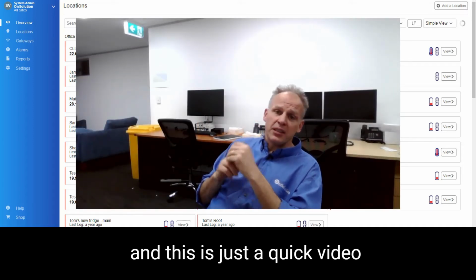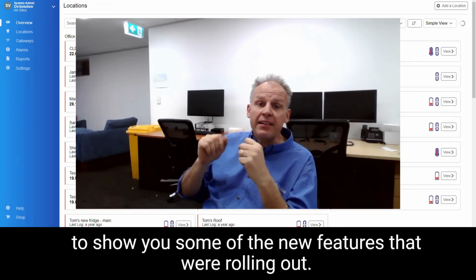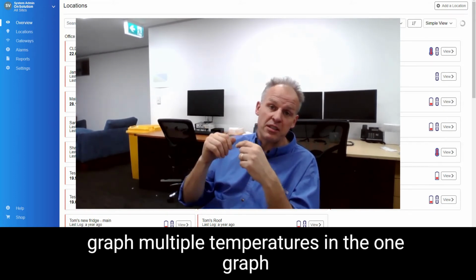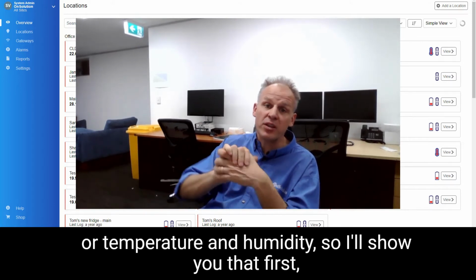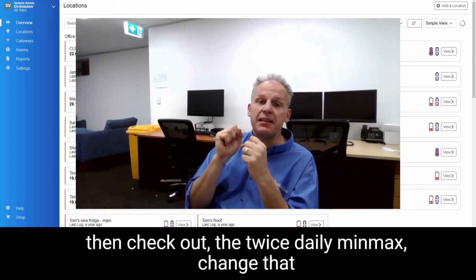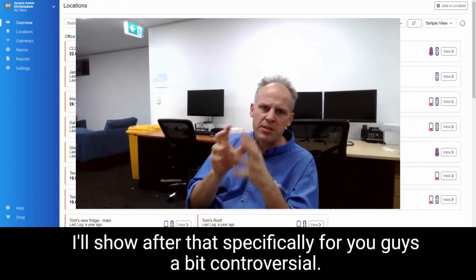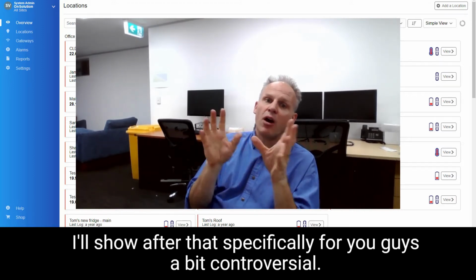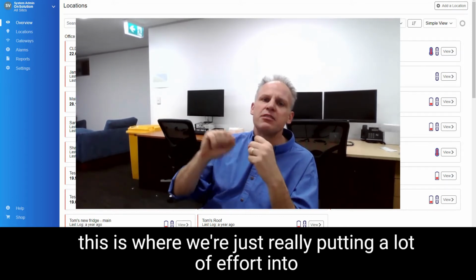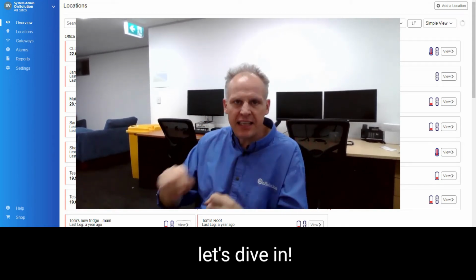This is our next release, and this is just a quick video to show you some of the new features that we're rolling out. This one in particular is about being able to quickly and easily graph multiple temperatures in the one graph, or temperature and humidity, so I'll show you that first. But if you're a pharmacy or a GP, then check out the twice daily min-max change that I'll show after that. Specifically for you guys, a little bit controversial. I'm not a fan of it, and I'll explain why later. But yeah, this is where we're just really putting a lot of effort into showing data. But enough of me talking, let's dive in.